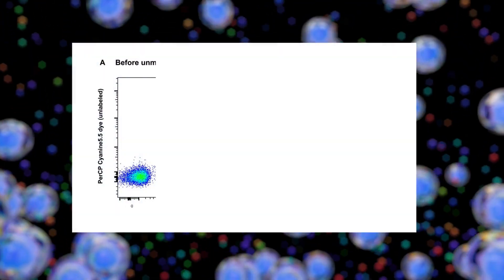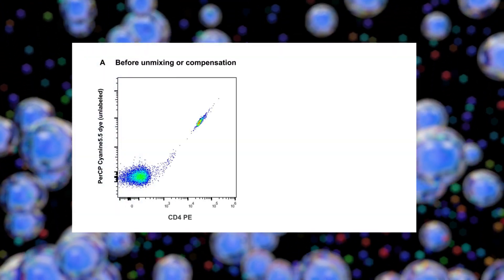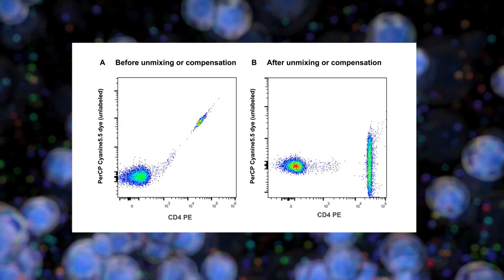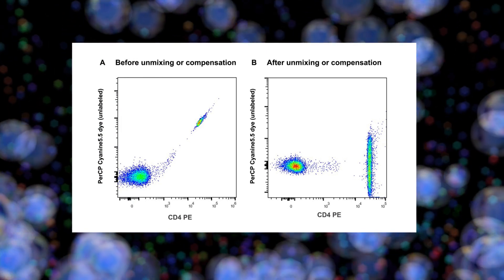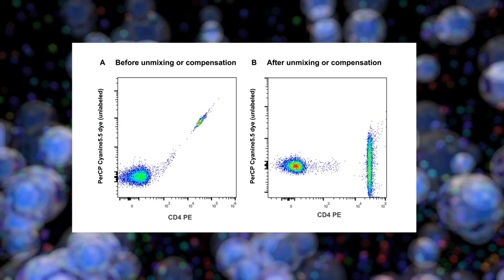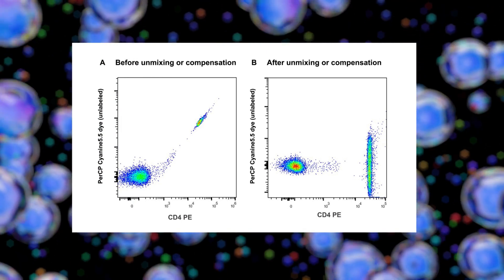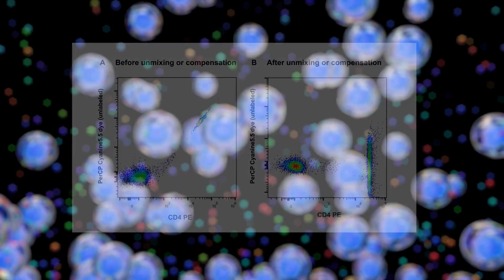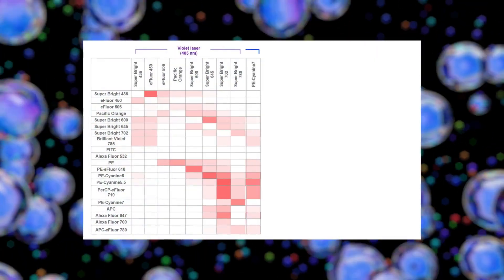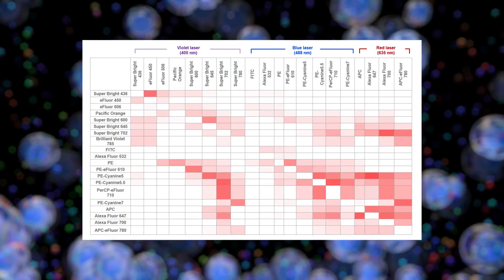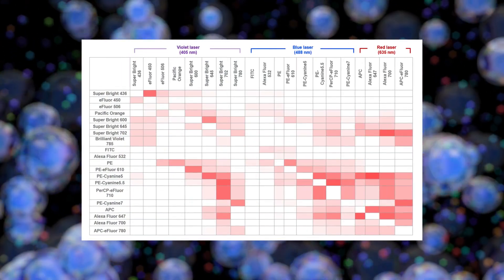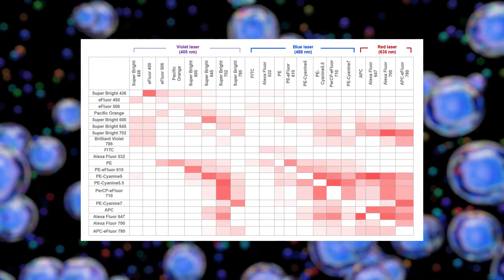When similar fluorophores are used together, spreading of the positive population can be observed even after compensation or spectral unmixing is applied. Careful panel design for spectral flow cytometry requires an understanding of the cytometer characteristics and fluorochrome properties.